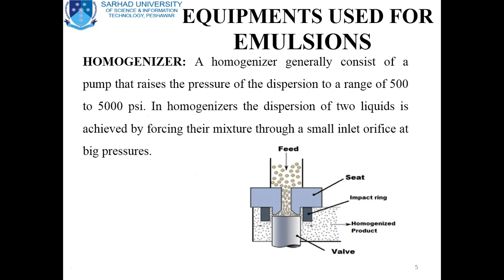First of all, we will discuss the homogenizer.